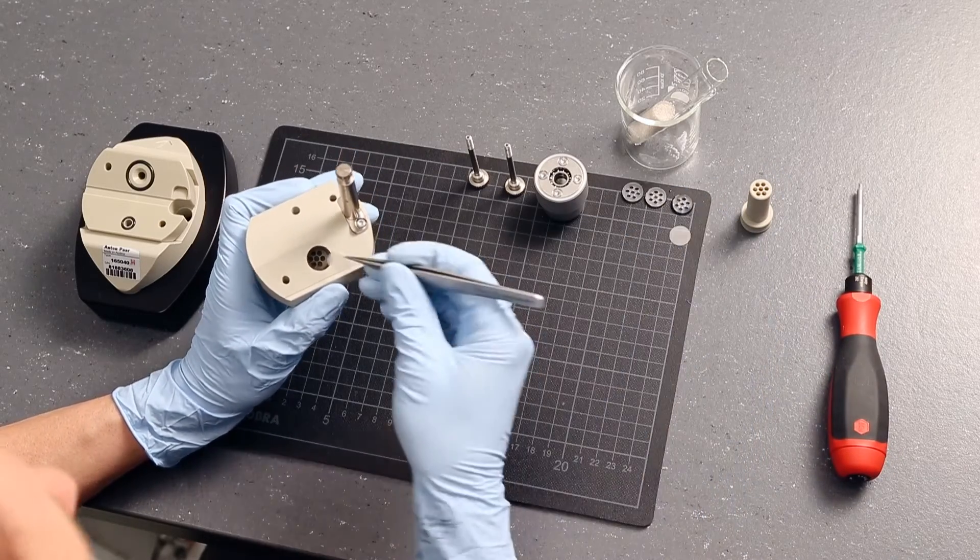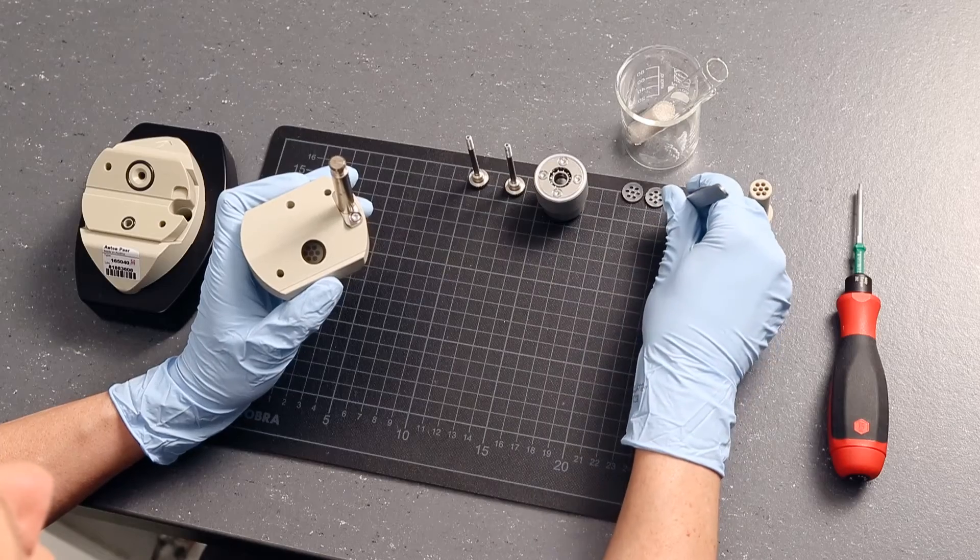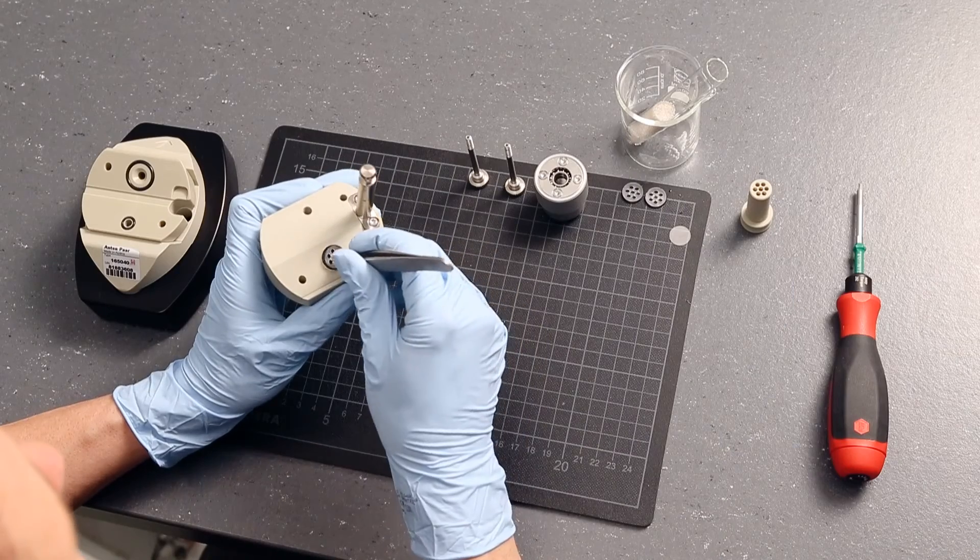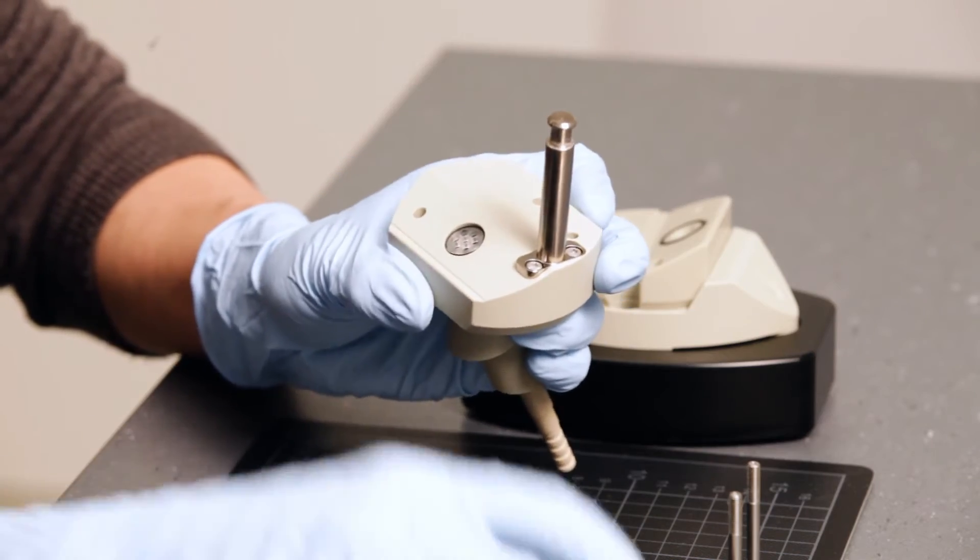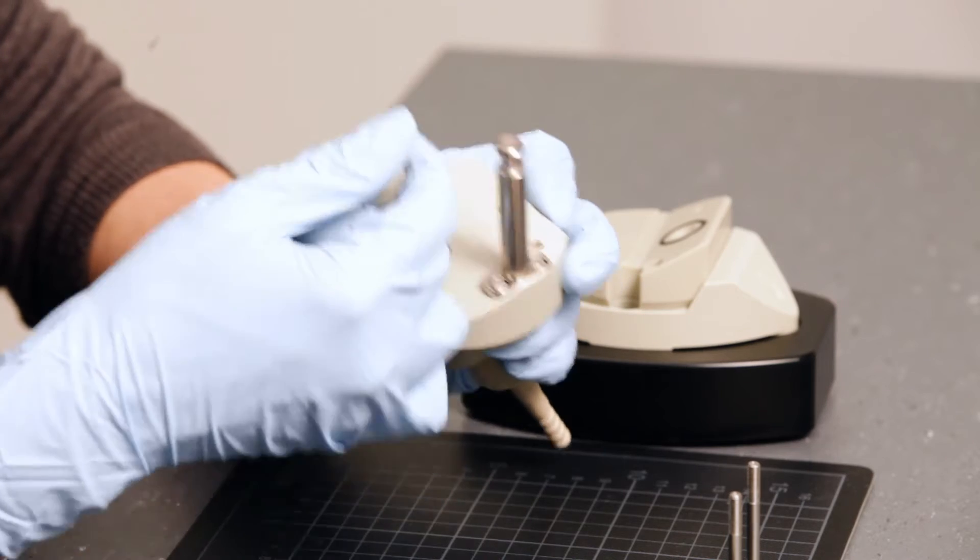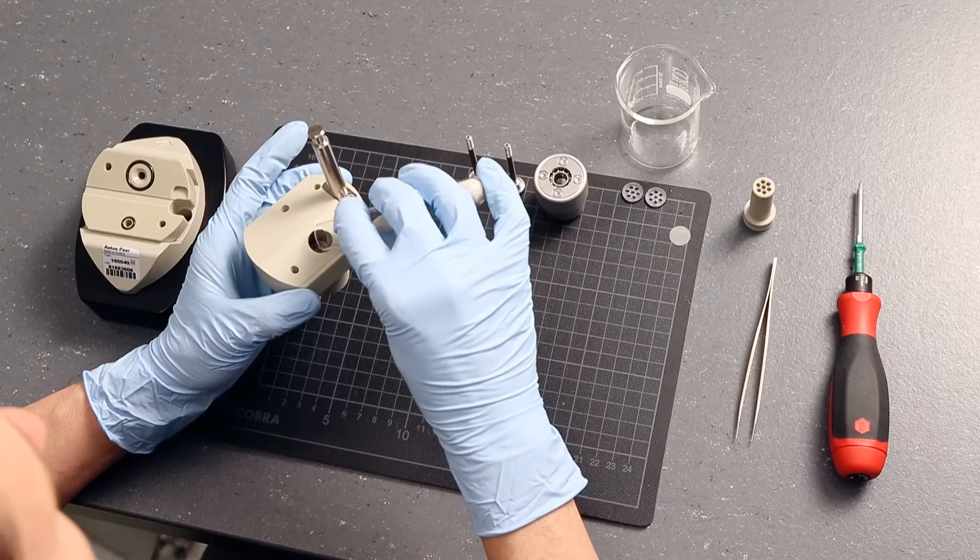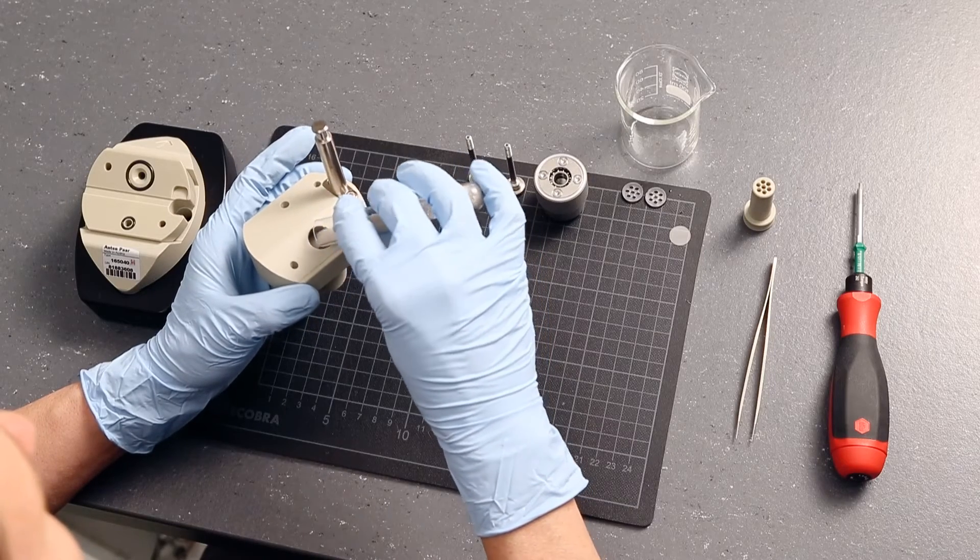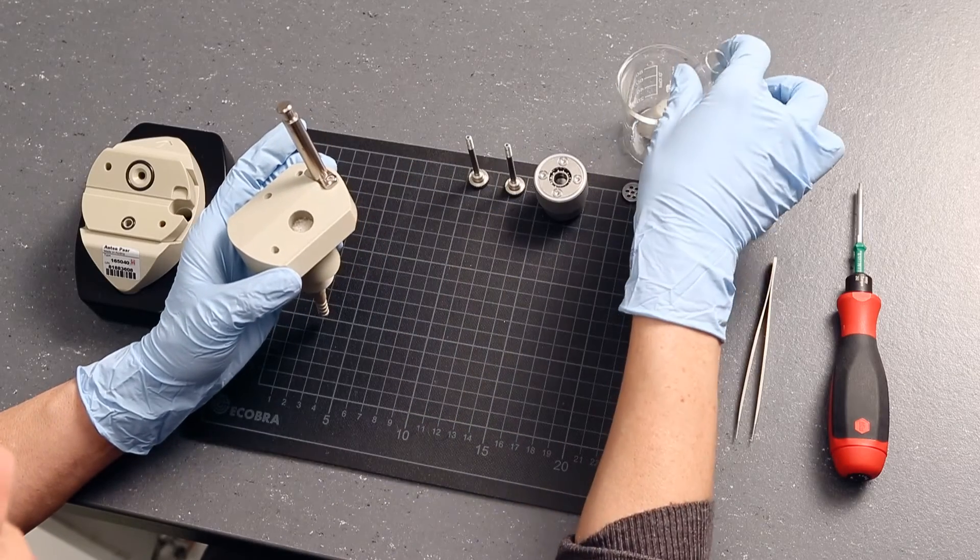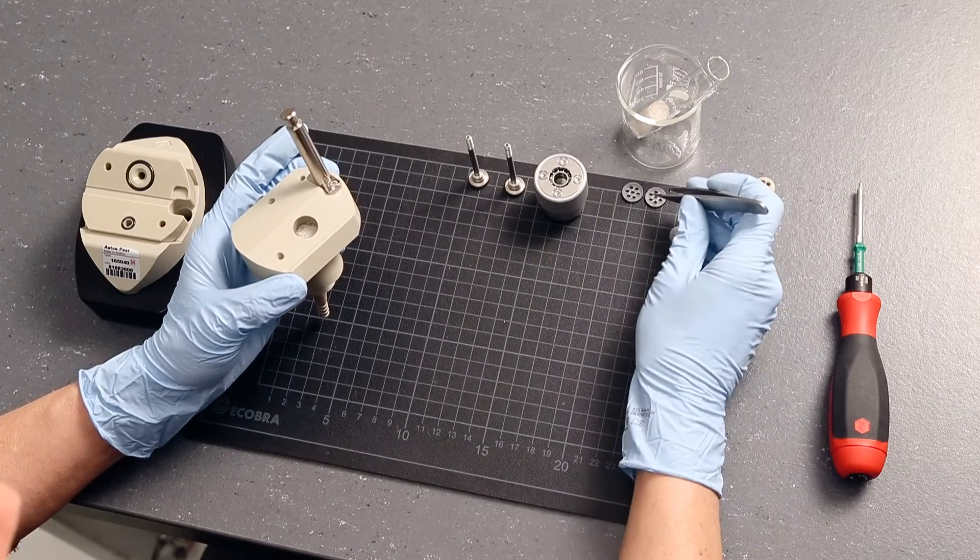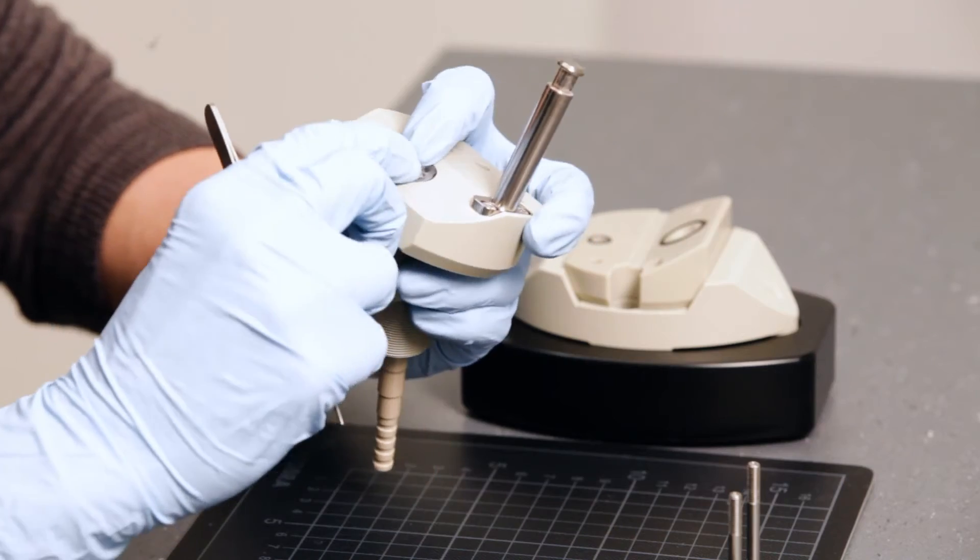Insert a filter disc and fix the filter with one of the support discs. Fill in the granular sample. Fix the sample with a stack of support discs and another filter.